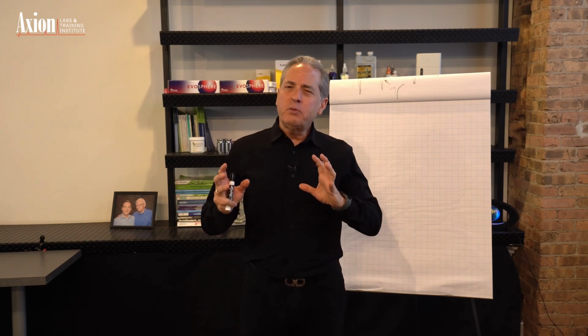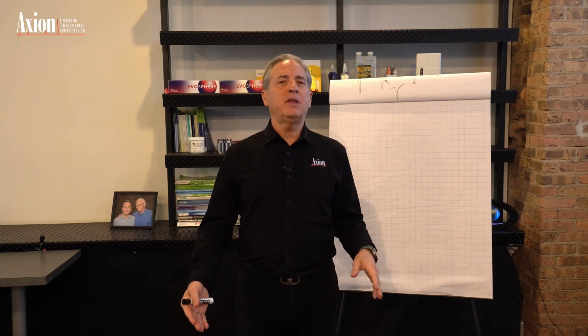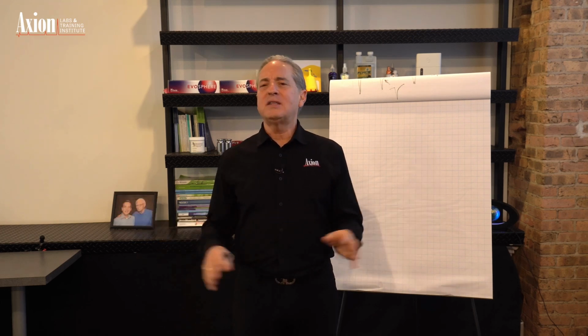But now let's remember what we learned in HPLC theory. Think about the Van Deemter talk. What did Van Deemter teach us? The smaller the particle, the better. No question, hands down, the smaller the particle, the better the efficiency, the better the separation, the better everything. But it causes a huge increase in the required pressure.